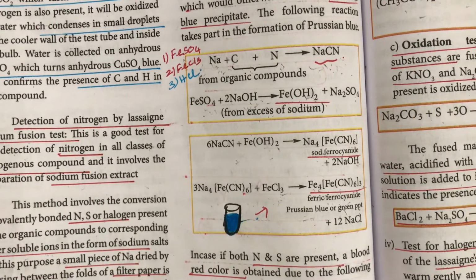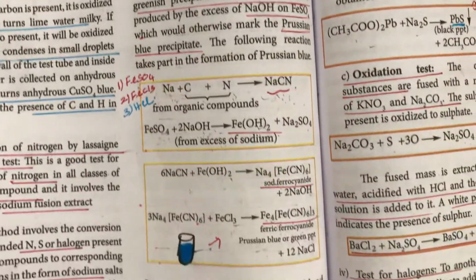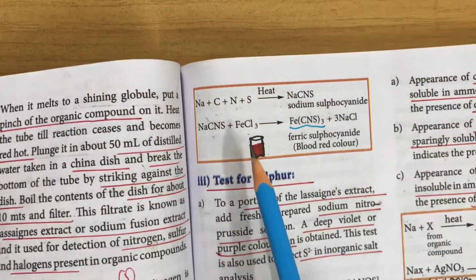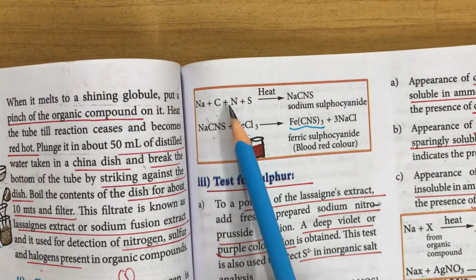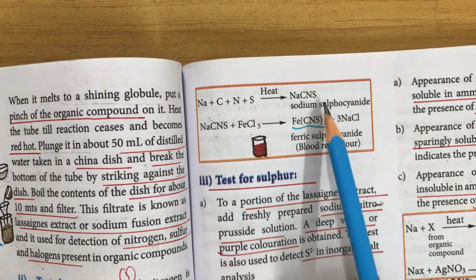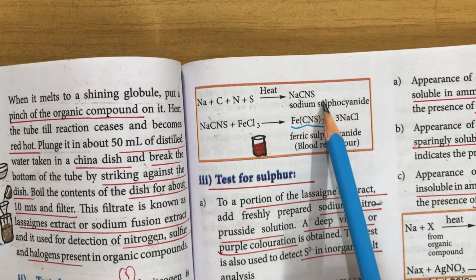So this is the test for nitrogen. For example, if an organic compound contains nitrogen along with sulfur, what is the test? For that we add ferric chloride to the sodium fusion extract. If nitrogen along with sulfur is present, it is in the form of sodium sulfocyanide.